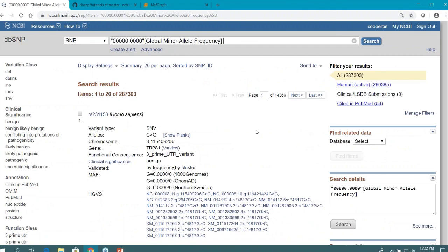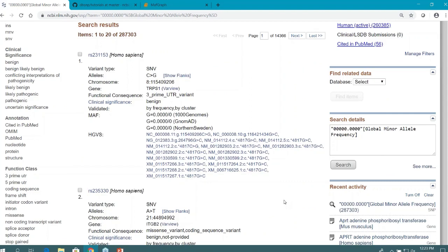Typically what I like to do is look at the outliers. So I looked for variants where the frequency is not detected in any of the projects or is rare. Here I'm querying where the frequency is 0. This suggests that there may be an assembly bias, that the assembly may have been incorrectly annotated at that position, so that when they compare against the assembly, they call a variant there, but when they genotype, it fails and they do not detect heterozygosity or low frequency.